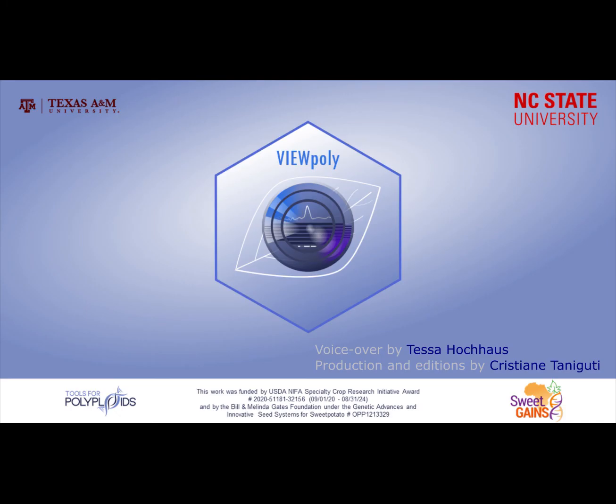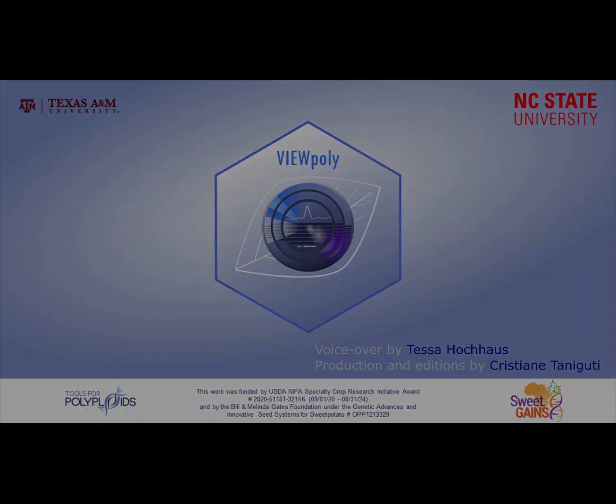For now, in the VIEWpoly 0.1.0 version, that's it. The authors intend to expand the app to support inputs from other softwares and to follow their updates. If you have any issues, questions, or suggestions about VIEWpoly, you can submit an issue on the GitHub page or send an email to the authors. Access the addresses on the tutorial page.